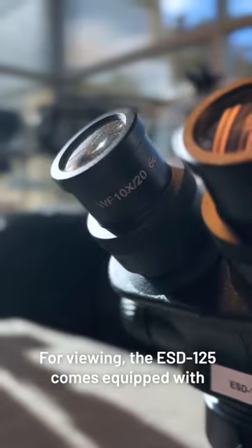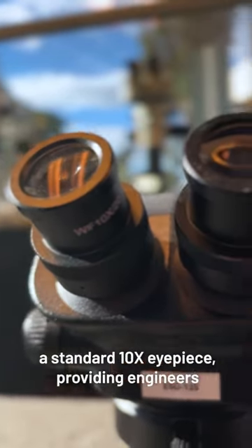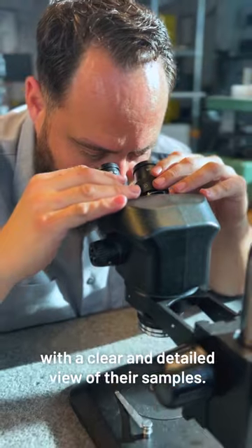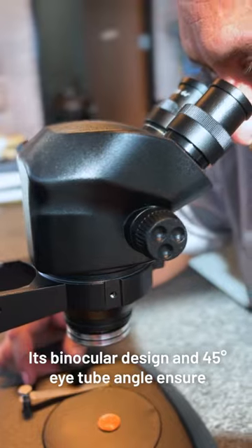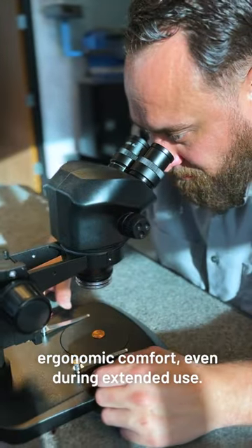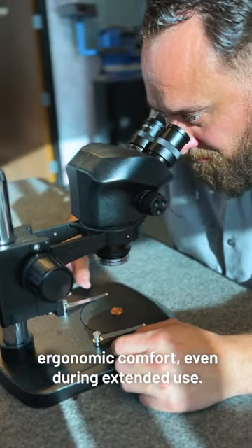For viewing, the ESD125 comes equipped with a standard 10x eyepiece, providing engineers with a clear and detailed view of their samples. Its binocular design and 45-degree eye tube angle ensure ergonomic comfort even during extended use.